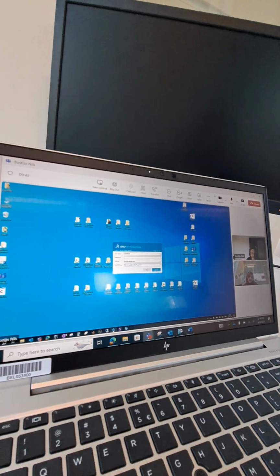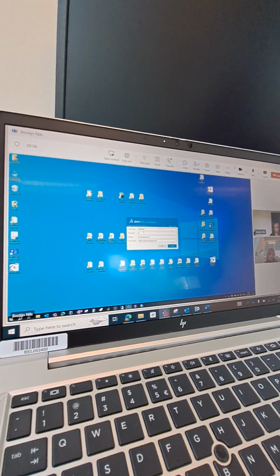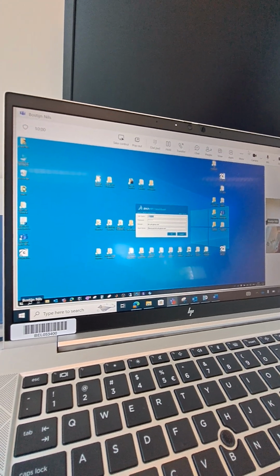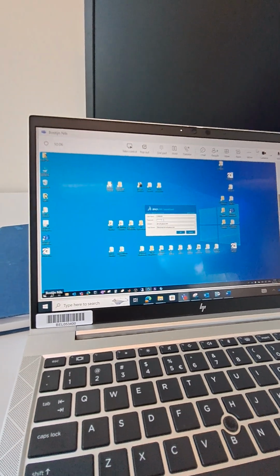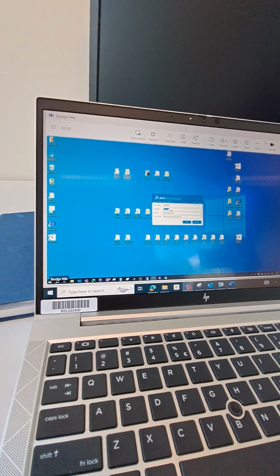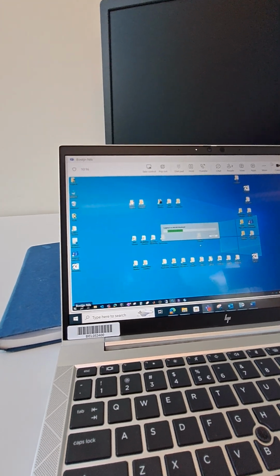When you click on the icon, this little screen will appear, and basically here it's just to log in. So it's your corporate account. I think you have a U number or an E number. Yes, I have an E number. Then your password. These two other things should be fine, so you don't need to change them. And then you click OK. And then the software will open.